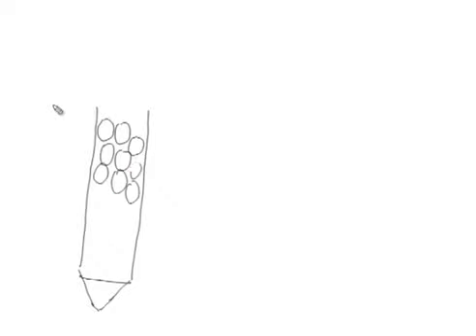These beads are porous beads, actually hollow beads. If I draw a single bead here, it is totally hollow inside and has a particular pore. This is just a schematic: these are cross linked polymers and they present a gel like structure and have a particular porosity because of the cross linking.